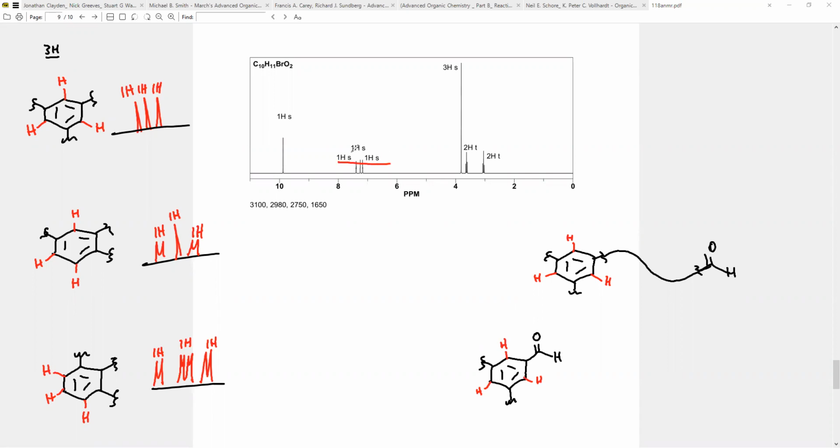And underline these. Again, I don't really know which one is which, but I don't really care. I just wanted to get the pattern down. Let's make this hydrogen this color here. Cool. So now I have 2 different chains. Looks like I have a bromine and an oxygen left. Just got to figure those out.